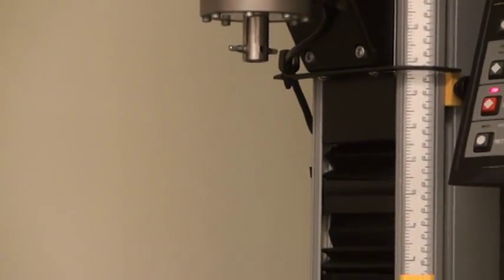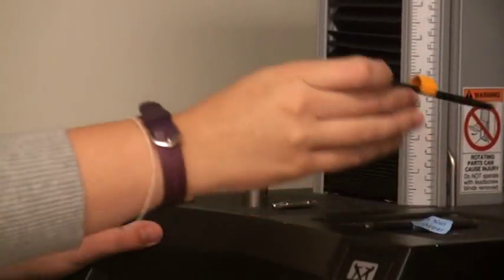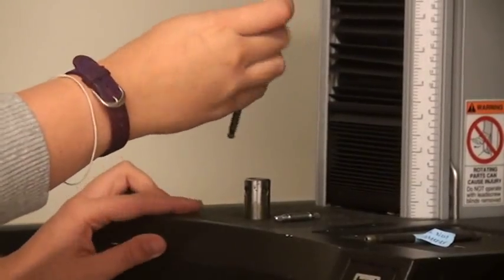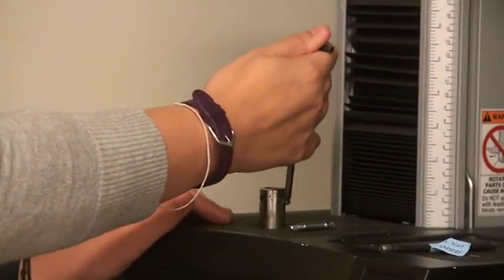You can remove the lower collet by removing the internal screw with a 3/16 inch hex wrench. Do not twist the collet itself or you will risk damage to the pins that hold it in place.